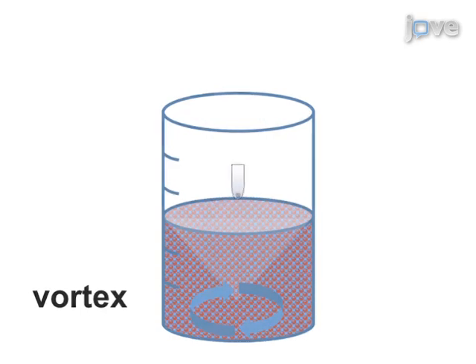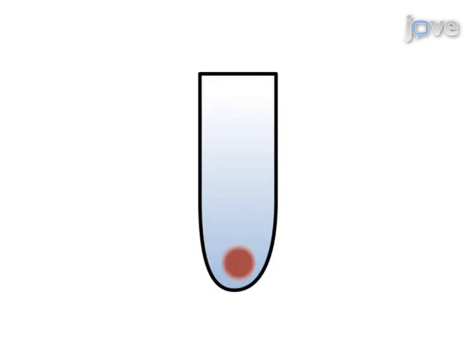Next, the particles are washed, collected by centrifugation, and lyophilized for long-term storage.